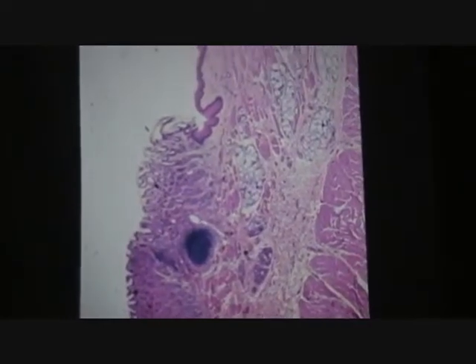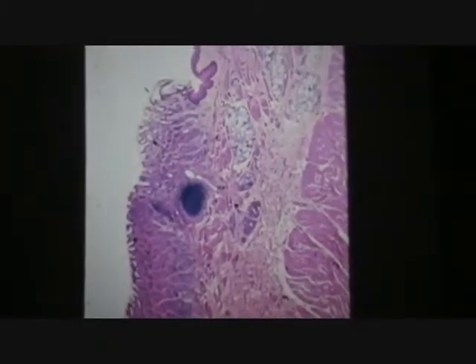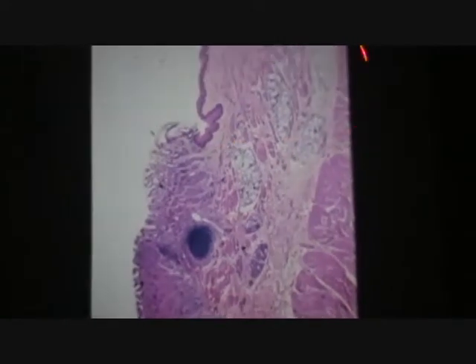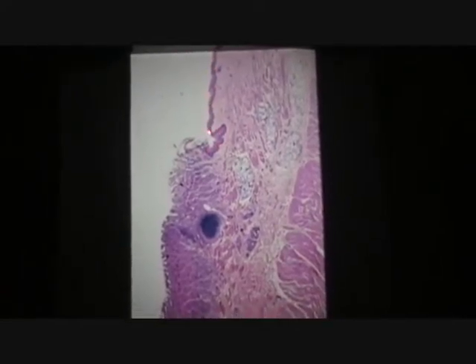And then we traverse further into the next compartment. So from lecture, you would call this the GEJ right there, gastroesophageal junction, where you've got that zone telling you it's esophagus right there, stratified squamous. And then you see how abruptly it changes. And now you've got the cardia of the stomach, where you know it's attached.